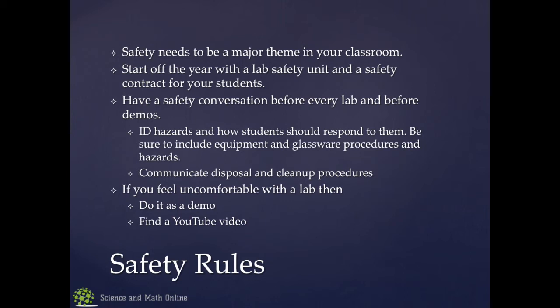Once again, when you start doing labs, this will become more second nature, and you need to be aware of these things. If you have questions about what something means on a material safety data sheet or on a chemical bottle, you can email, message, or come to office hours. All right, the last thing we're going to look at is chemical hygiene in the last lesson.